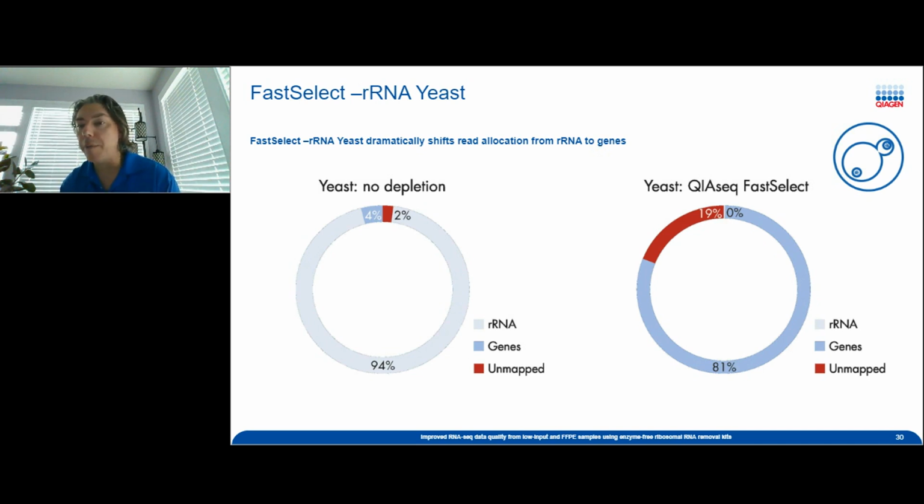because we were doing either mRNA enrichment or we didn't really have the power to see the low expressing RNAs that are there. And one of the things that we always stress in our handbooks is that if you see a lot of unmapped reads, make sure that you go back and map those, or change the reference sets that you're using for your pipelines.